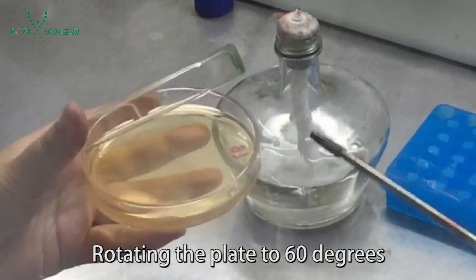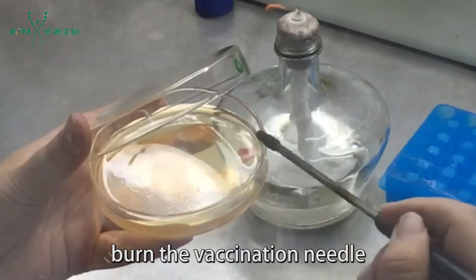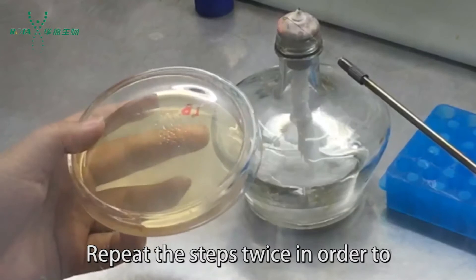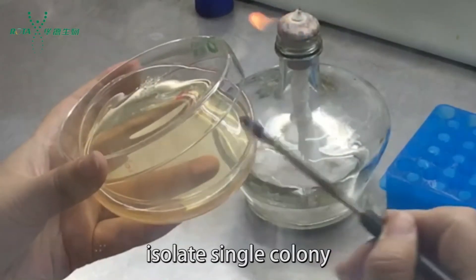Rotate the plate to 60 degrees and burn the inoculation needle. After cooling, cross on the plate again. Repeat these steps twice to isolate a single colony.